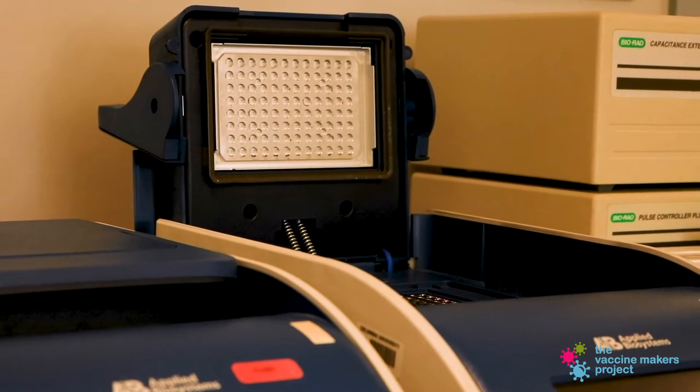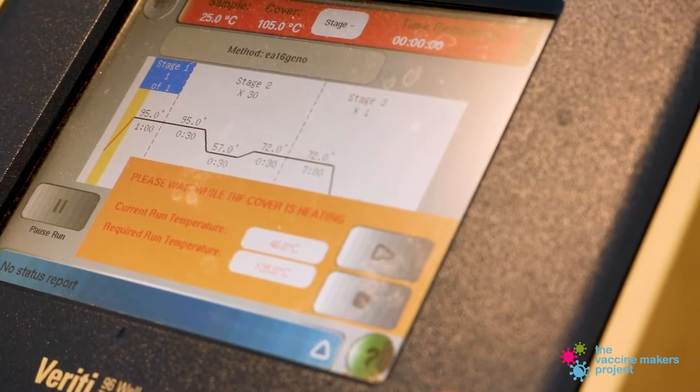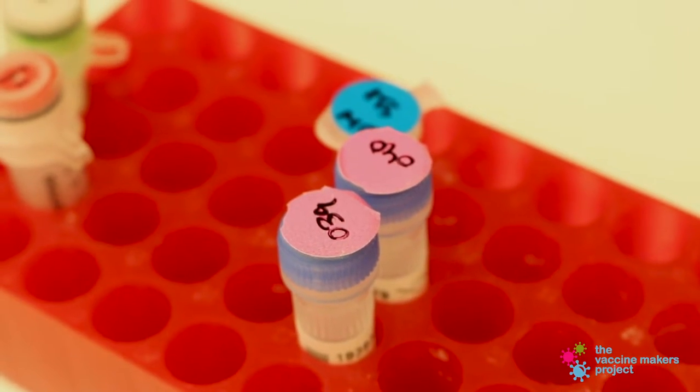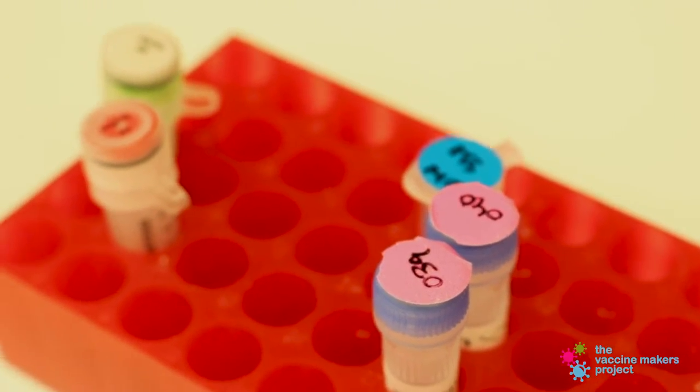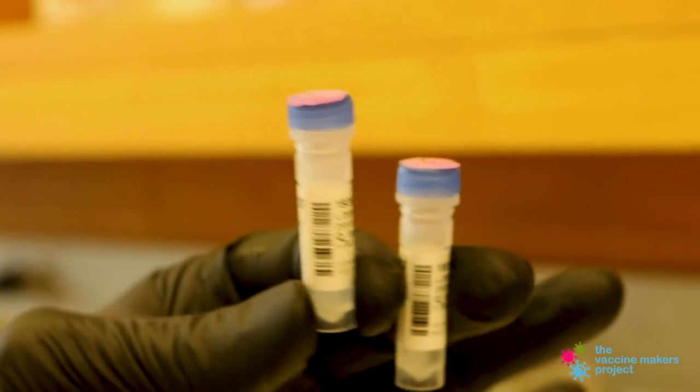One of the main advantages and the reason that we use PCR to begin with is because typically when we have a sample of interest that has DNA we want to investigate, normally the amount of DNA present is too small to reliably do tests on, so it's required that we amplify that DNA before we can really investigate what's going on.